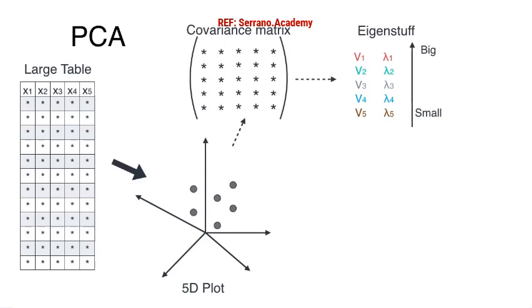That depends on the eigenvalue or on how many dimensions we want to get to. But let's say we pick the top 2 and erase the bottom 3. So now what do we do? We go back to our 5-dimensional plot and plot those 2 eigenvectors with the length being the corresponding eigenvalue. So we get these 2, the red and the green.